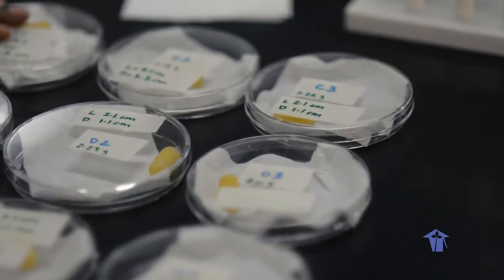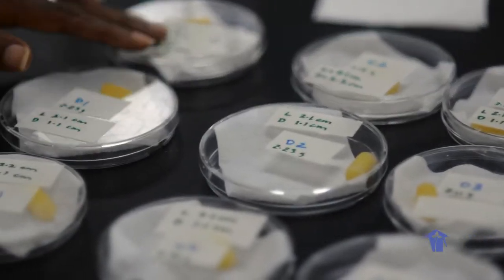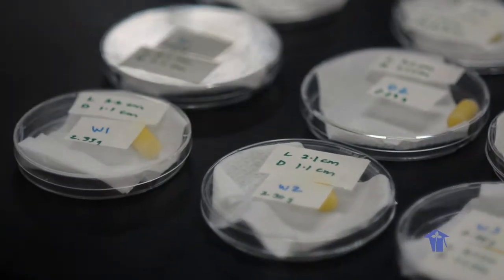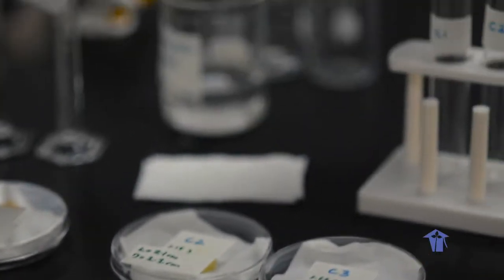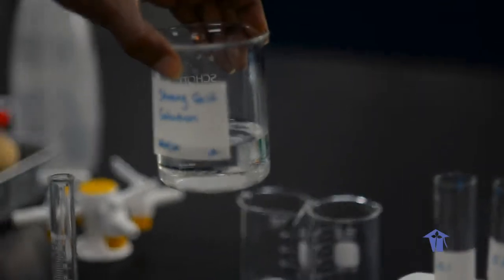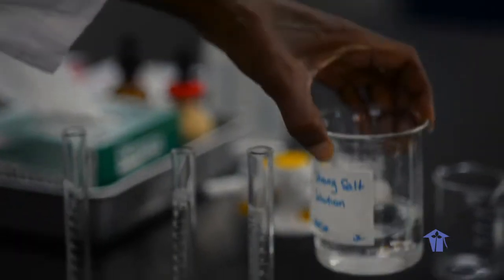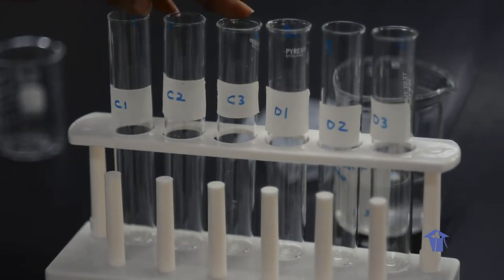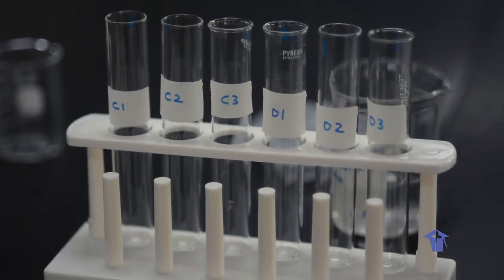We are going to put three of our pieces of potato, which we have in these petri dishes, into a concentrated or very strong salt solution. And we are putting these into boiling tubes C1, C2, and C3.